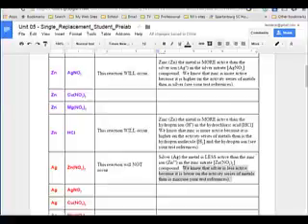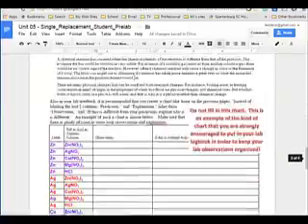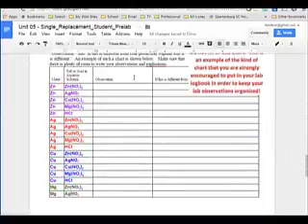Now then, I want to jump down to the bottom of this document, a couple pages away, and I want you to go there with me and get out your lab logbook. So you're going to finish the chart here for predicting whether reactions will occur later. It's homework. Right now, I want to show you what to put in your lab logbook to prepare to collect data for tomorrow's lab. Now, this chart kind of gives you a good start on how to do that.